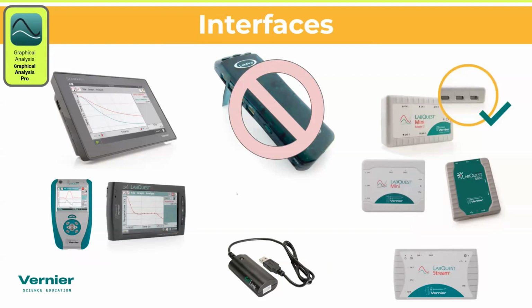So if you have a Lab Pro and that's the only interface that you've been using, you're going to need to switch at some point as you're making that transition. We recommend going to the LabQuest Mini. The top one here is the current rendition of that. The two below are just older versions of the same thing, and basically they all work with those applications.